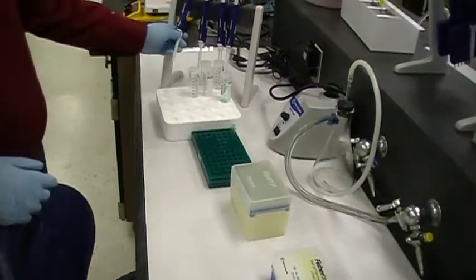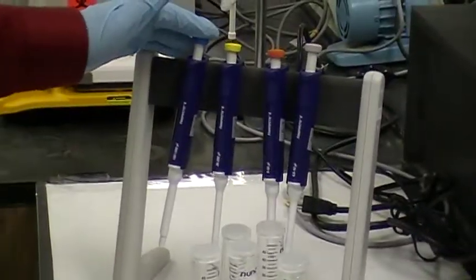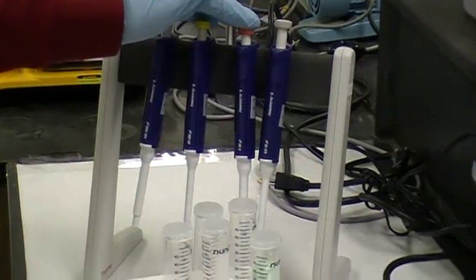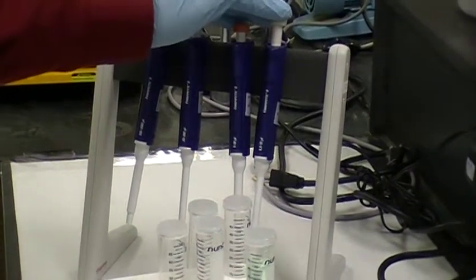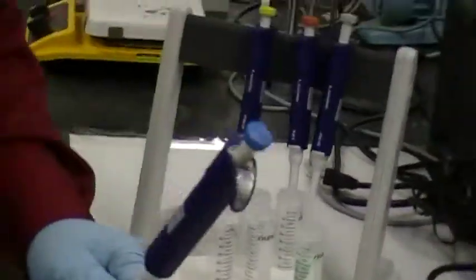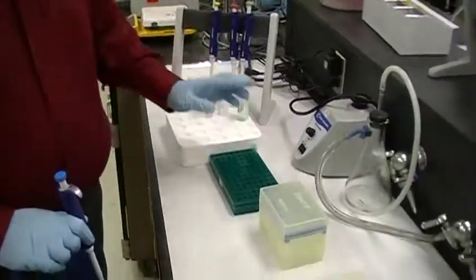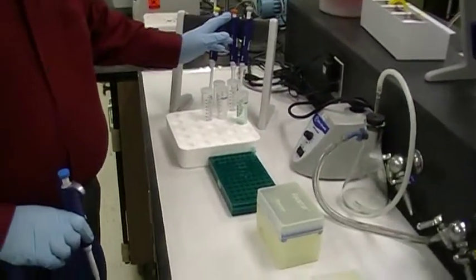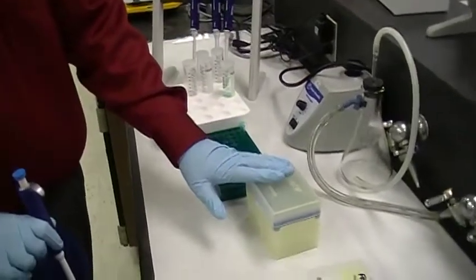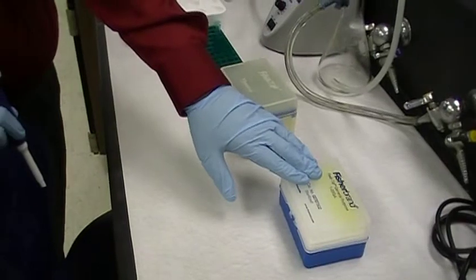By the way, these are all called by the following names: P1000, P200, P50, and P10. The large tips we call blue tips. And then we have a smaller box that takes the P200, P50, and P10. You have the blue tip for the large pipette, and the yellow tip for the small pipettes.